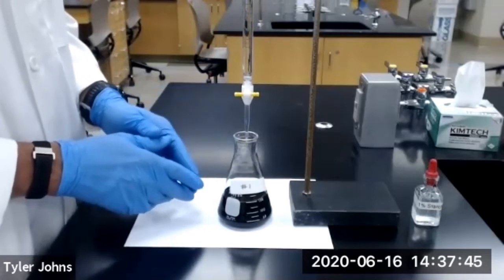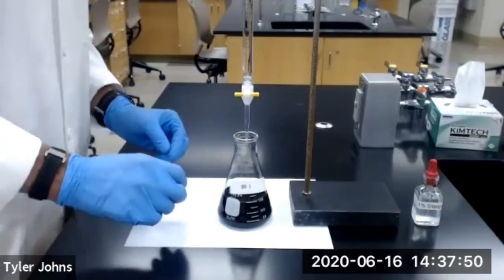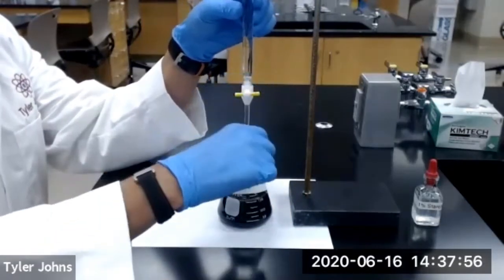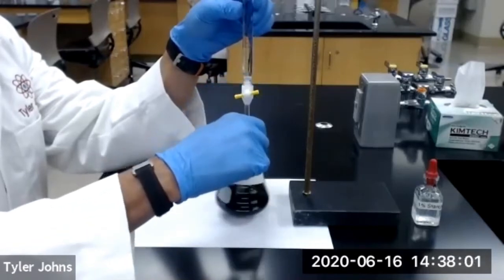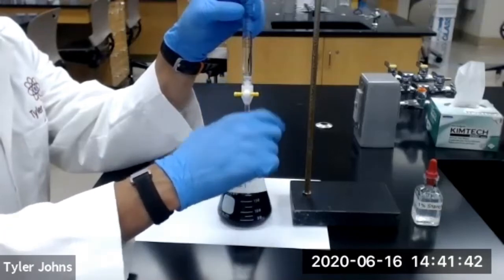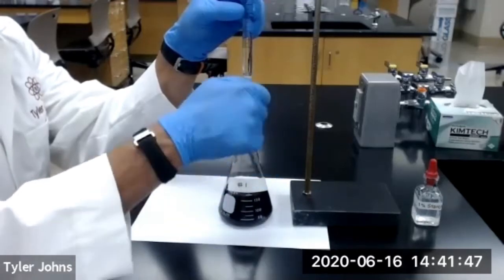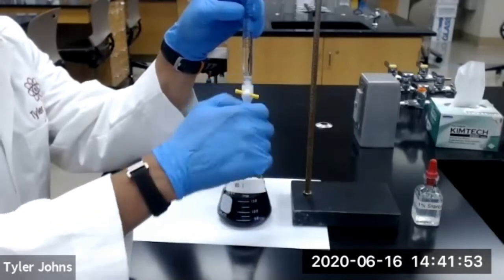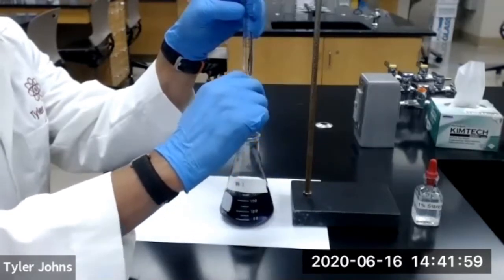The endpoint for this titration is just until the blue color disappears. So our solution is starting to become lighter in color.